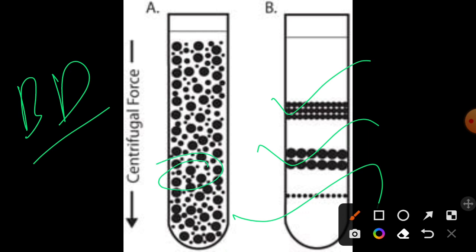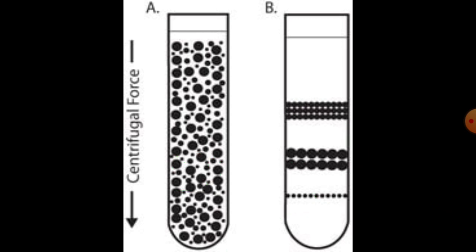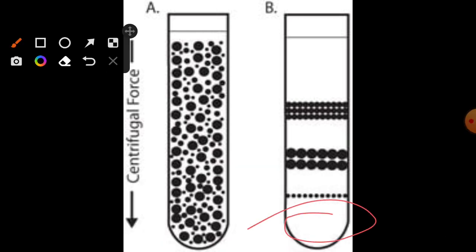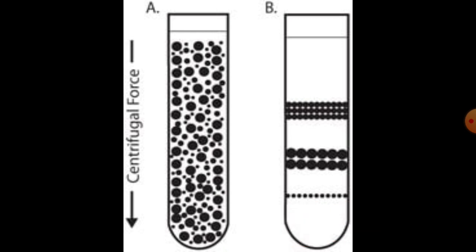When the macromolecule's buoyant density matches the density of the local environment, it stops at that position, and this is totally time independent. Another important thing I need to mention is that in isopycnic centrifugation you do not get any molecule that settles down at the bottom. As you can see, no molecule settles at the bottom. That is another interesting thing about isopycnic centrifugation.